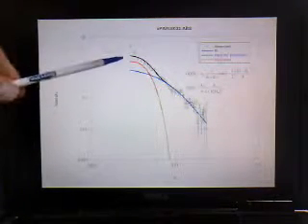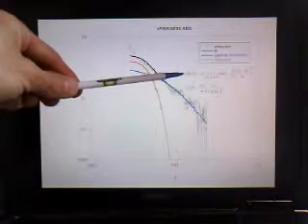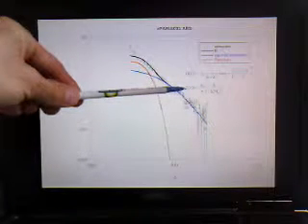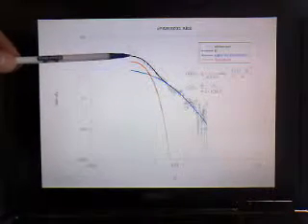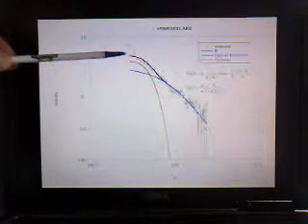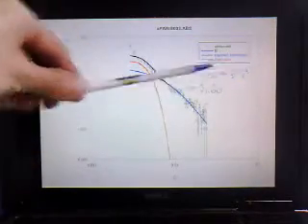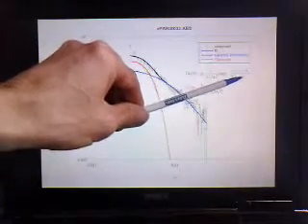Nevertheless, what I'm going to do is fit these data to a simpler model which contains just the Gaussian function and the Lorentzian function that we used last time. And since we don't really have the centroid pinned down very well in these data, I'm going to fix the value of the centroid of the Gaussian, a sub 2, to be the average value of what we got for all the large scan, the full Q-scan data that I presented a couple of days ago. And also, I'm not going to vary the Gaussian width either. I'm going to use the average value.